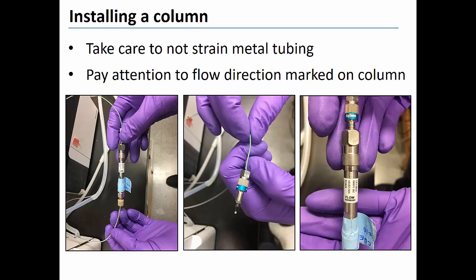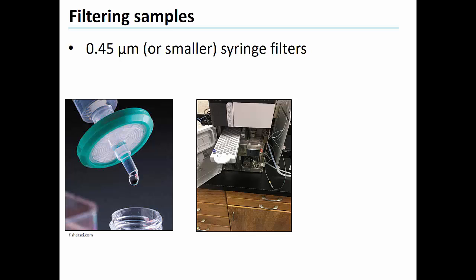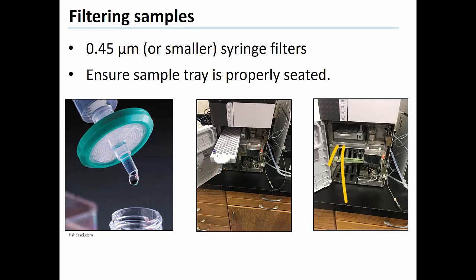Care should be taken to remove particles from all samples analyzed by HPLC. Particles can clog and damage the instrument's components. The best way to minimize damage due to particles is to pass all samples through a syringe filter with a pore size of 0.45 microns or less. After loading samples in the auto sampler tray, be sure the tray is seated properly in the instrument. If the tray is not properly seated, the instrument will not permit you to start an analysis.